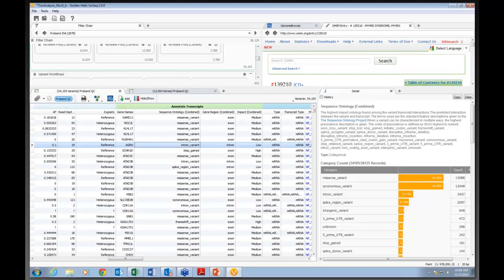Can you use Varseq to look at variants shared by a proband and his brother or uncle rather than a trio analysis? Yes, you can do that. It is possible. It's just slightly different startup on the workflow, and it might be slightly more difficult to automate that as a repeatable workflow, but as a one-off exploratory workflow, no problem at all.